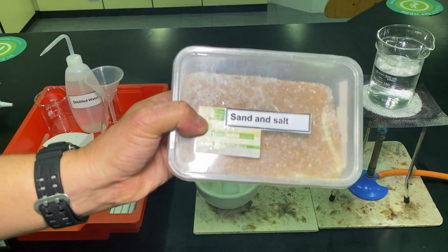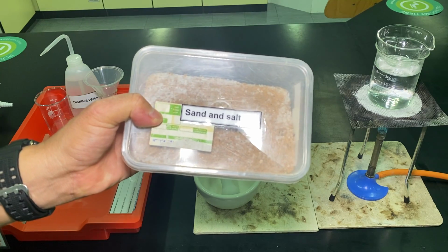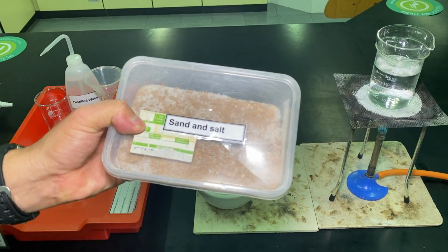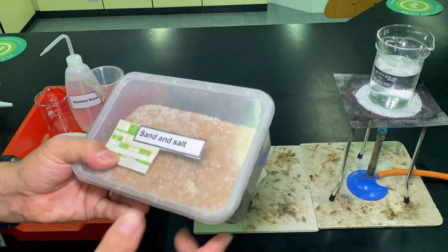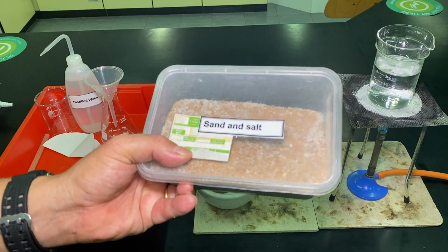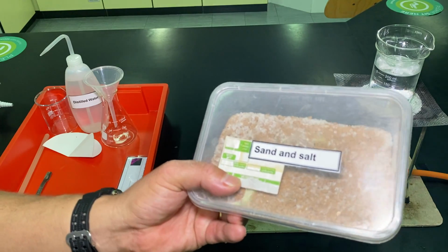Rock salt is a mixture. It's not a compound, it's a mixture between sodium chloride, which is a compound, and rock and sand. Now, if it's a mixture, we can separate it by physical processes. So that's the key idea we're going to take away here. Mixtures can be separated by using a physical process.